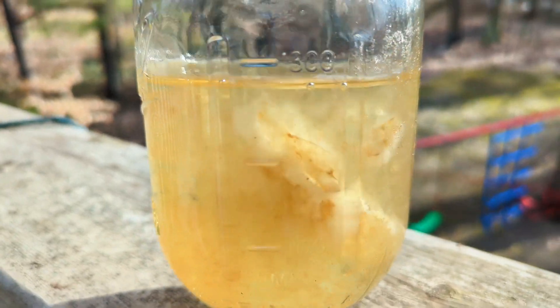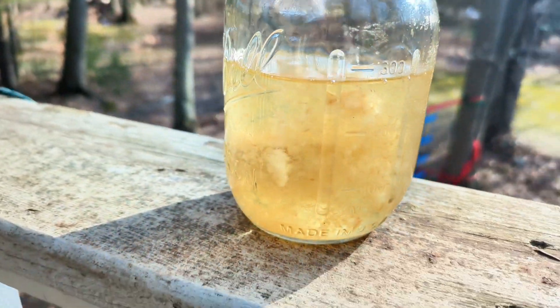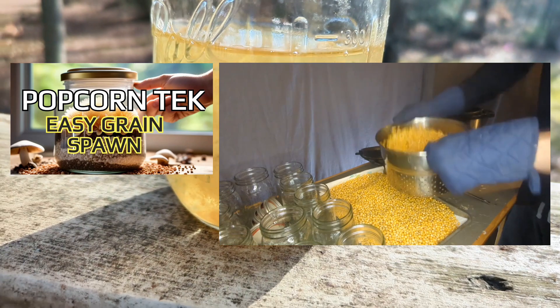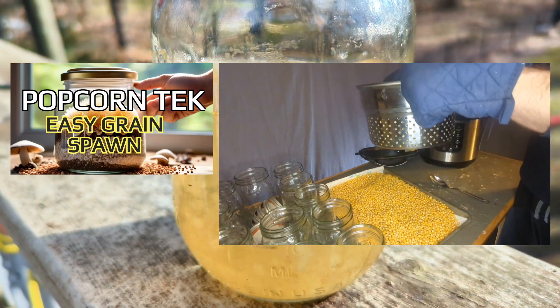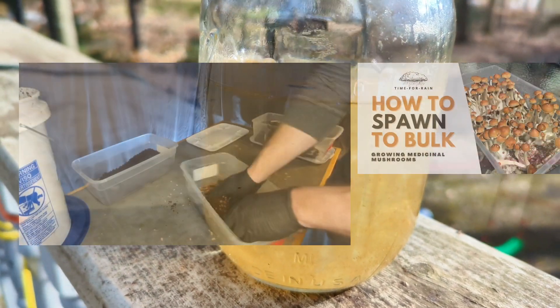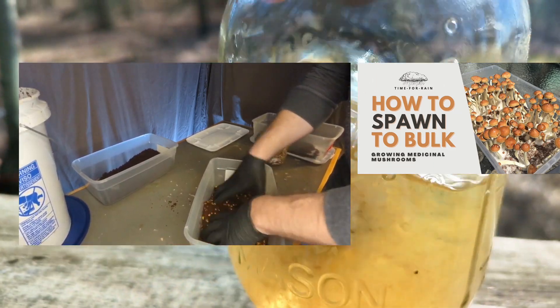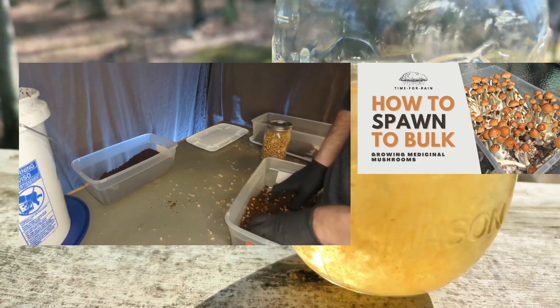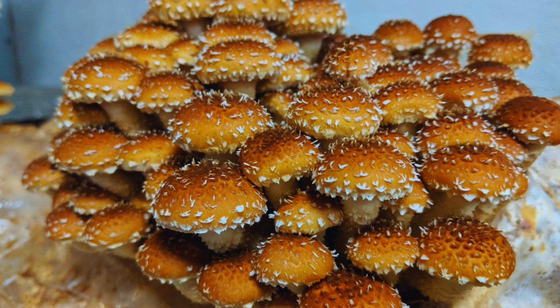From here, you take it out of the jar using syringes and squirt it onto your grain spawn. Your grain spawn will then be colonized by the mycelium, and you'll expand that fully colonized grain spawn onto your bulk substrate — either coco coir or sawdust. In this case it's going to be sawdust, because this is a chestnut mushroom liquid culture — one of my favorite kinds of mushrooms — and we're going to be testing it out.